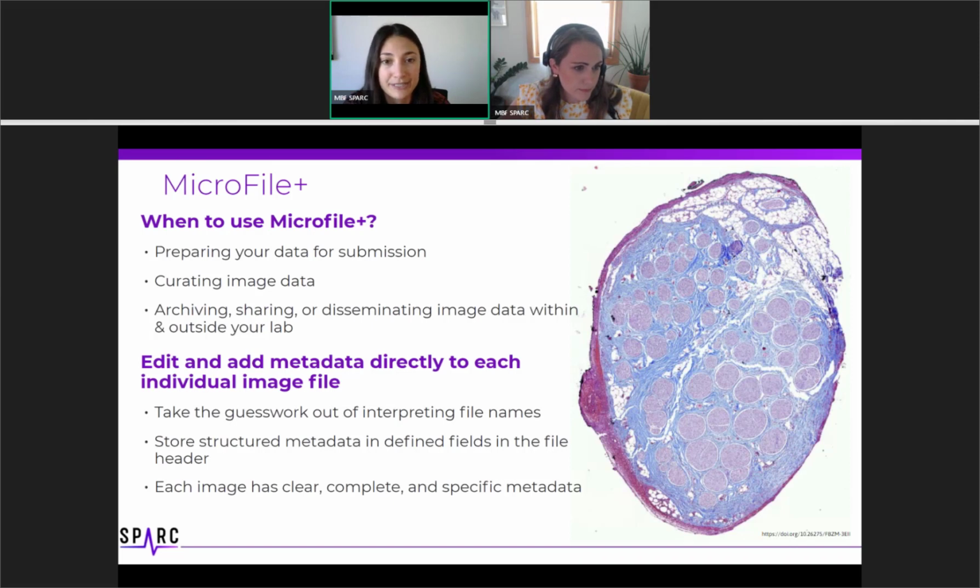These abbreviations can even cause confusion within the lab. I'm sure you've all experienced rotations of postdocs or undergraduate students who need to be brought up to speed on this shorthand.